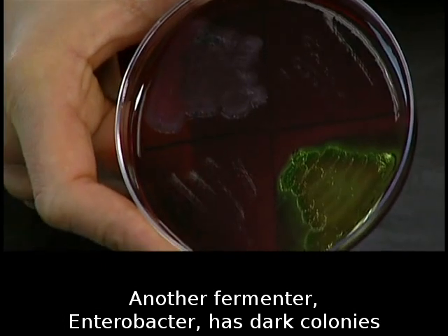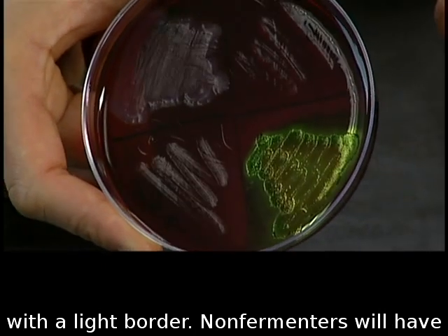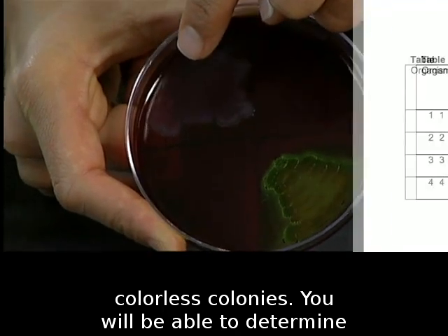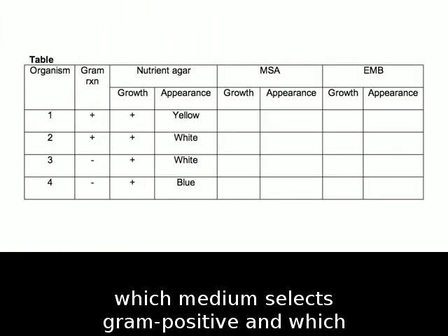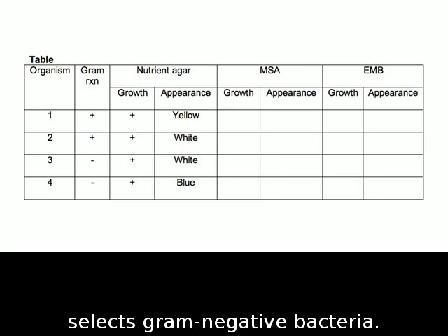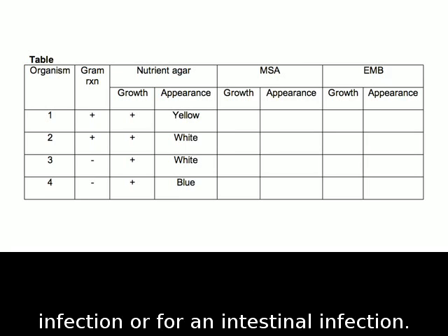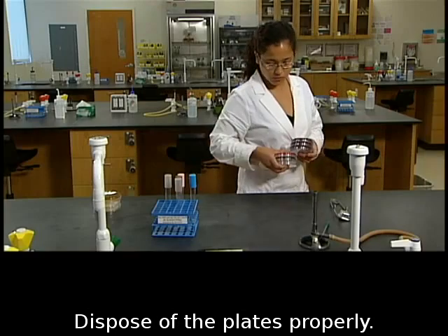Another fermenter, Enterobacter, has dark colonies with a light border. Non-fermenters will have colorless colonies. You will be able to determine which medium selects gram-positive and which selects gram-negative bacteria. Thus, you will learn which medium to use for a skin infection or for an intestinal infection. Dispose of the plates properly.